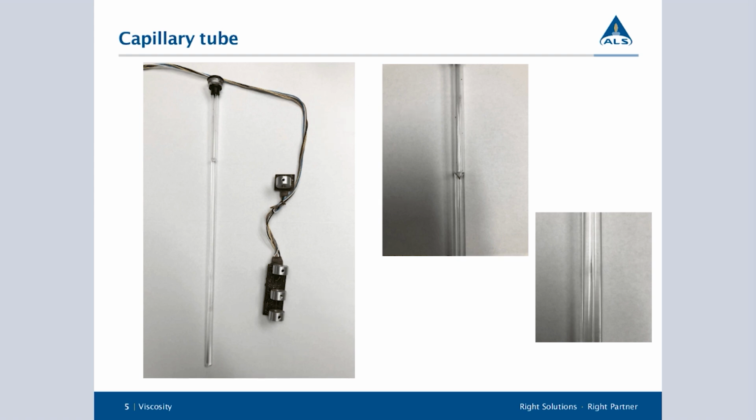And so that's why it's gravitational forces. We obviously have pieces of our equipment that assist us in running it, so we don't just have to put it in and then start a stopwatch and stop a stopwatch.